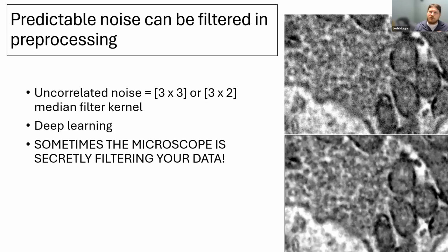If you start to push your system to doing very fast imaging, for our system it might be something like 100 nanosecond or 50 nanosecond dwell time, you start to enter a range where maybe the engineers weren't really expecting you to image that fast, and these filters can do very strange things to your data and your downstream analysis. Okay.